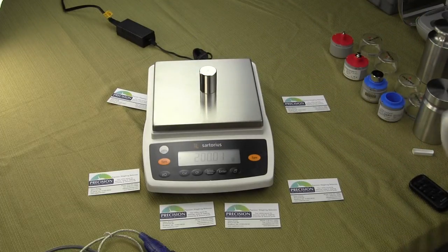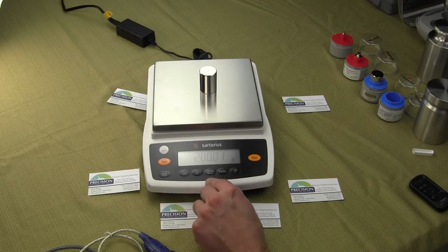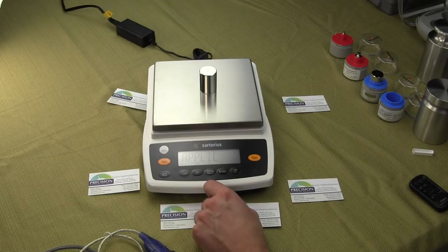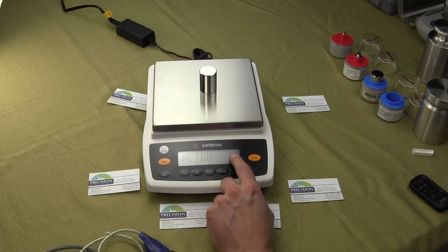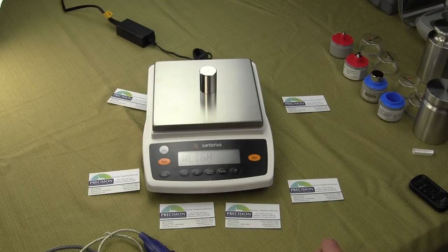You can see how fast the response time is of the balance. It's extremely intuitive. You have the select menu — if you press and hold down this button, you'll see we go into Applications. Once we're in Applications, you can hit Enter and you'll see we're in Weigh. You'll notice in the upper right-hand corner there's a circle, and that means that the balance is set for Weigh.